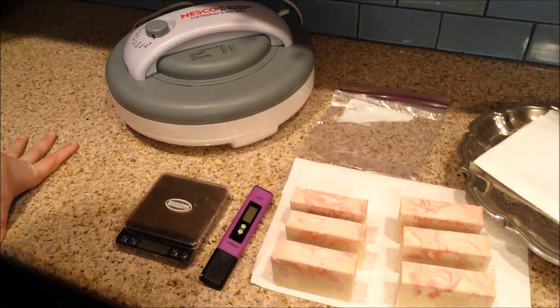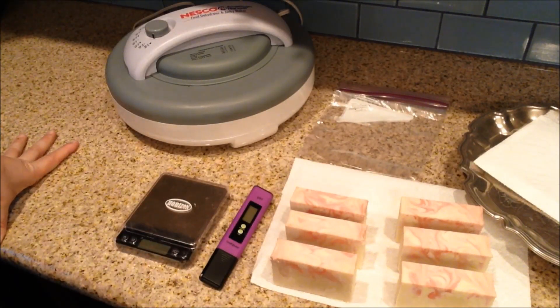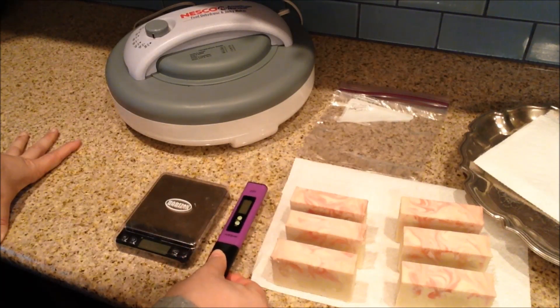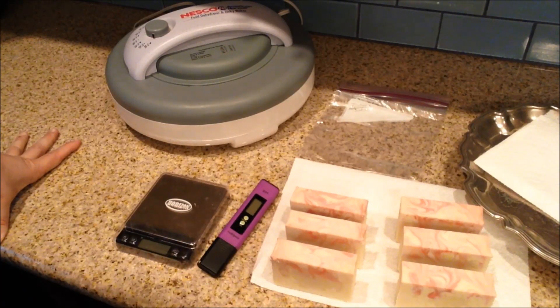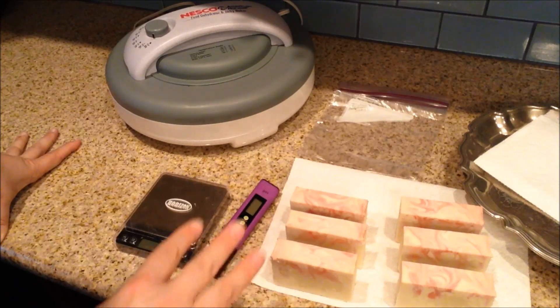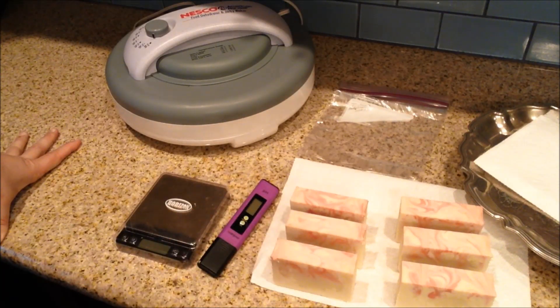Hey, soapy folks. This is Kevin with Divinely Design, and we have a soap experiment. I haven't done one in a while, and I've been thinking about doing this one for a little while, but I needed a special piece of equipment, so I finally got around to getting that, and that is a pH meter. The experiment I would like to do is testing weight loss and change in pH for a soap over time.